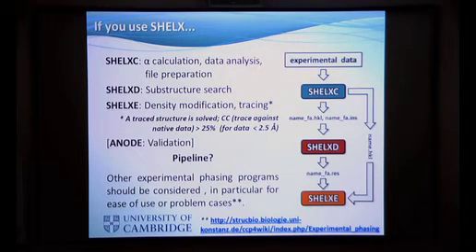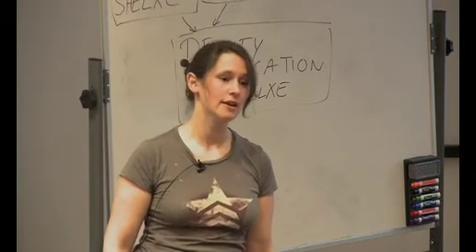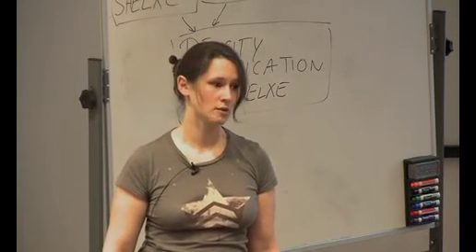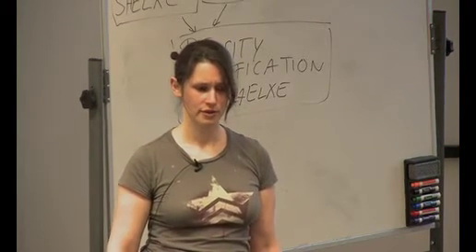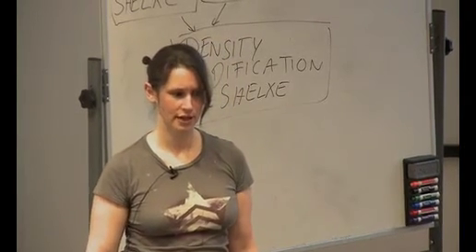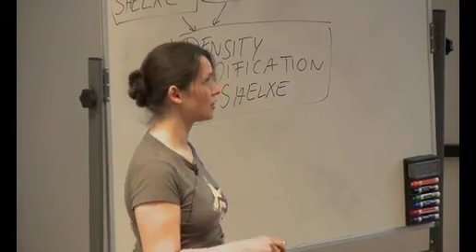And SHELXE does the density modification. It can also do tracing in the recent version. So if your computer says, by the way, SHELX 2000, I was recently in some university in Austria and they had 2002, I think. So please download the new version.